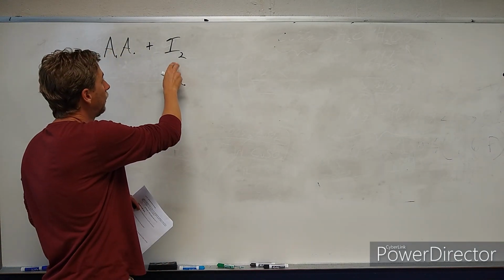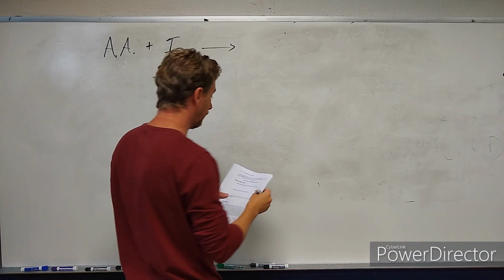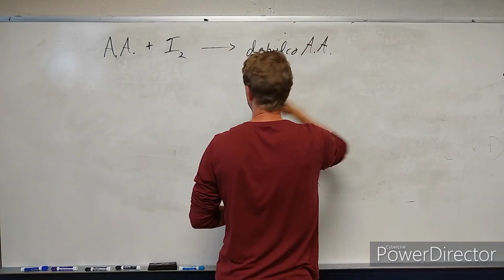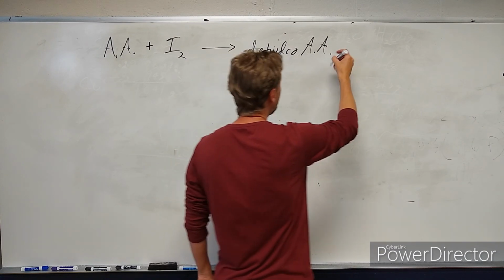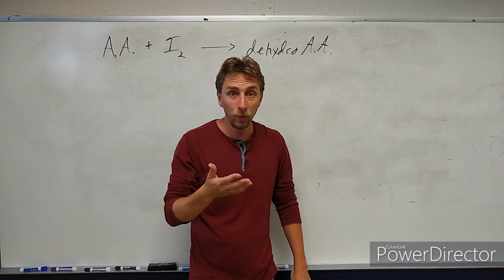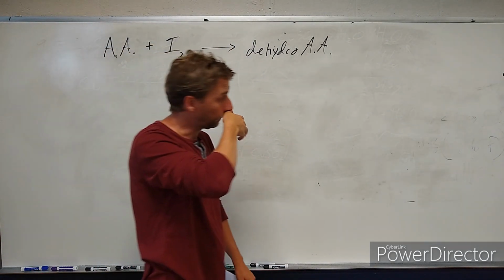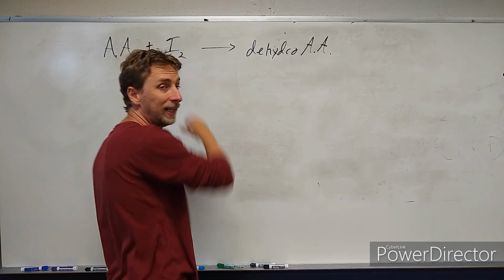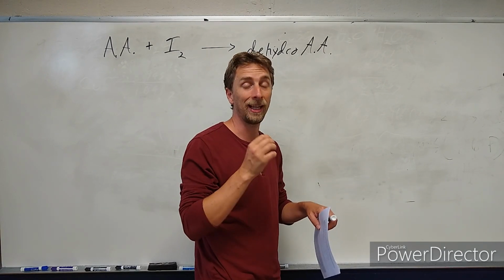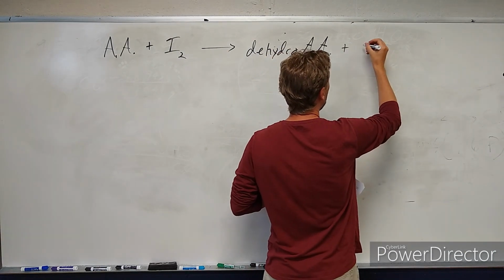So ascorbic acid reacts with iodine. It gets oxidized by iodine, and it forms what is called dehydroascorbic acid. So I'm just going to put dehydro AA. Okay, that's dehydroascorbic acid. And on the more fundamental level, when something is oxidized, it loses electrons. So the ascorbic acid gave up electrons. Now, where do those electrons go? Well, they go to the iodine. And that is the fundamental chemical definition of oxidation: it takes electrons from something. So iodine is taking electrons from the ascorbic acid, and that converts the iodine into iodide.